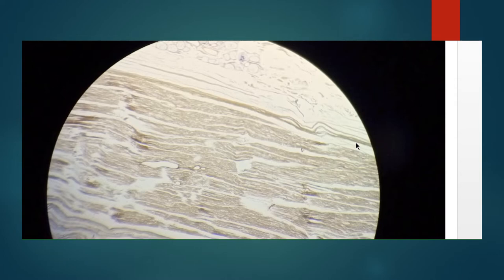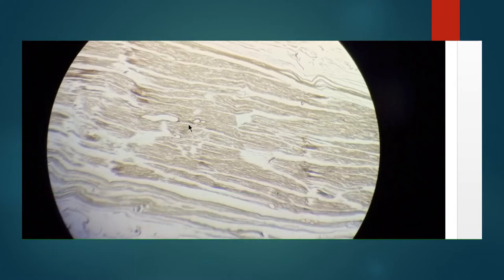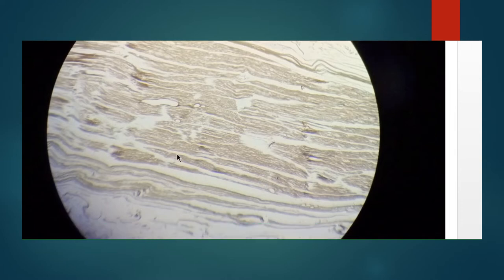So this is nothing but your peripheral nerve. How to identify the peripheral nerve? Try to see here. These are all the longitudinally arranged axons. These are all nothing but your axons. Here you can identify the adipose tissue and all, which is a connective tissue covering that nerve. So these are all the axons. So this is the peripheral nerve LS, longitudinal section of peripheral nerve. Now let us see the next slide.